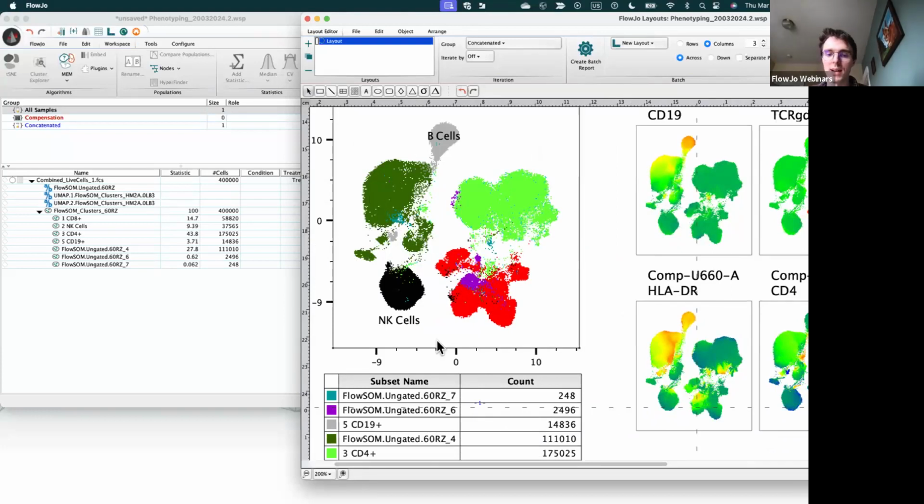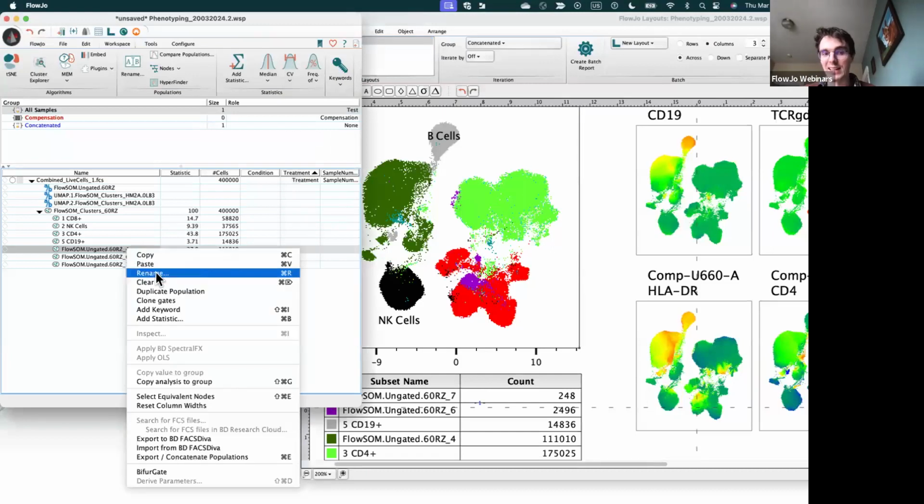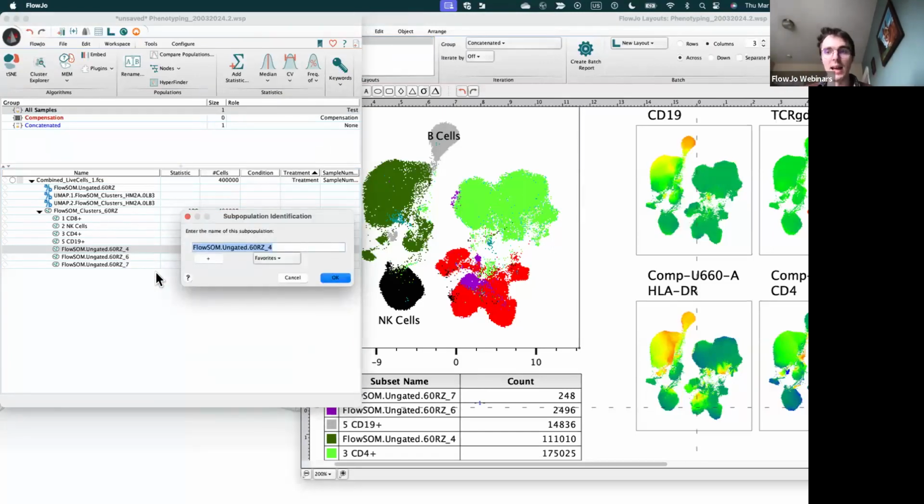So really, this cluster 4 here is like my unstained, or the things I didn't target within the panel. I'm just going to call it my unknown or my everything else. It's the cells I decided I didn't care about when I was designing the panel. I actually didn't design this panel, but the person who did weren't targeting these cell types.